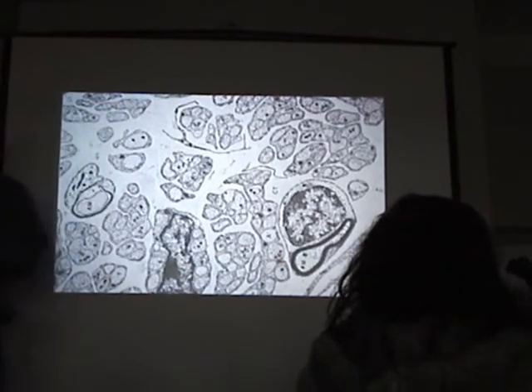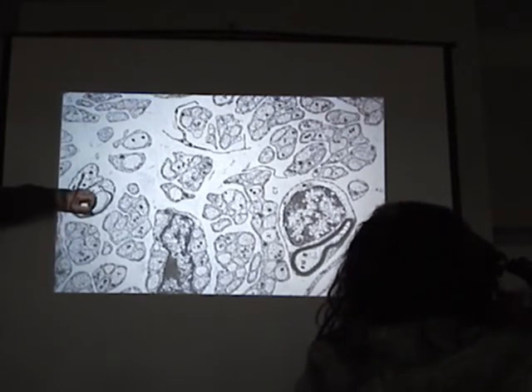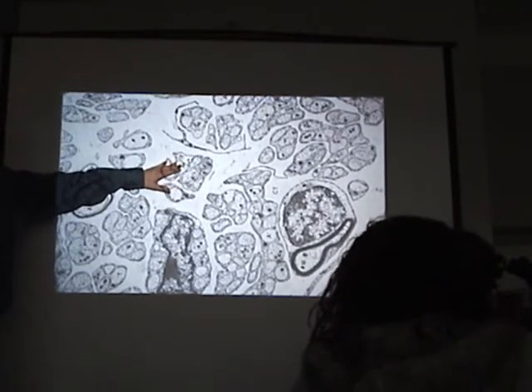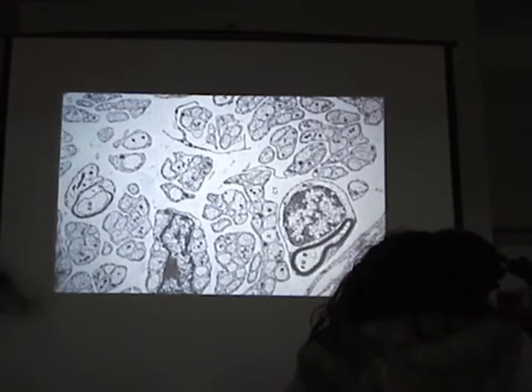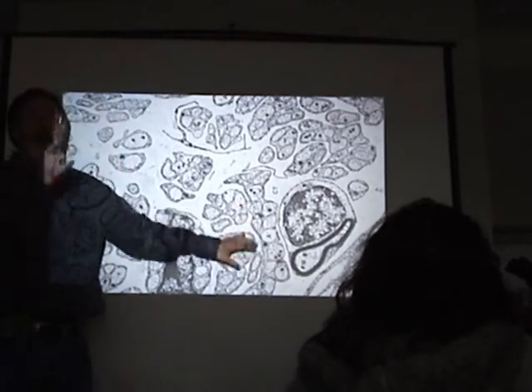Here, you've got an individual Remak cell, Schwann cells are sometimes called Remak cells, that invests, I counted 10 there, so multiple. So here we've got 1, 2, 3, 4, 5, 6, 7 unmyelinated fibers, all right? You might see an image like this on your exam. So what is it illustrating? Myelinated fibers and unmyelinated fibers.